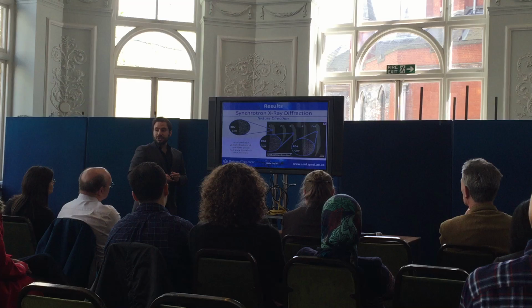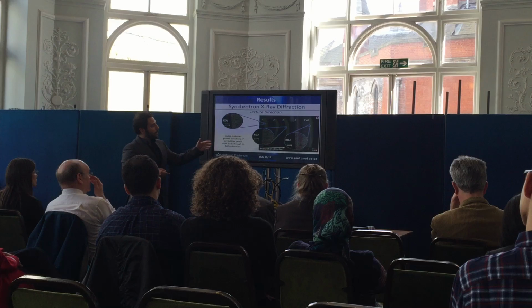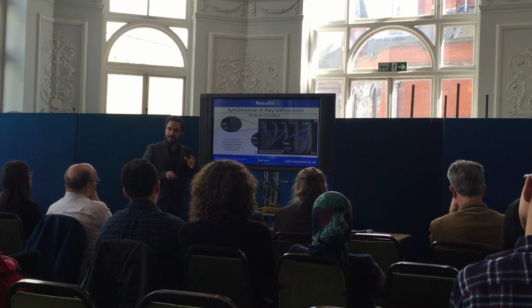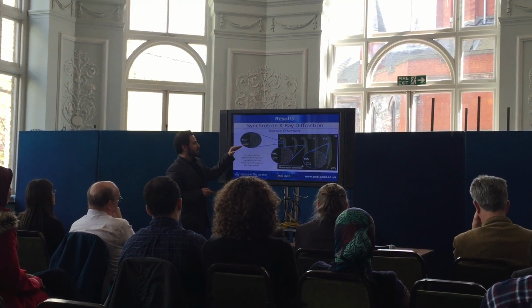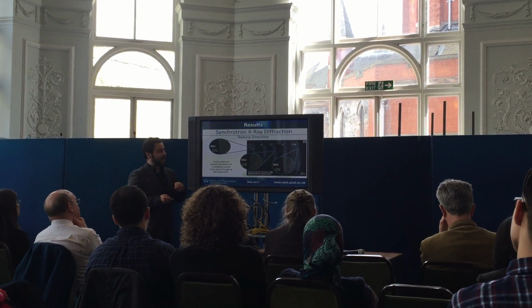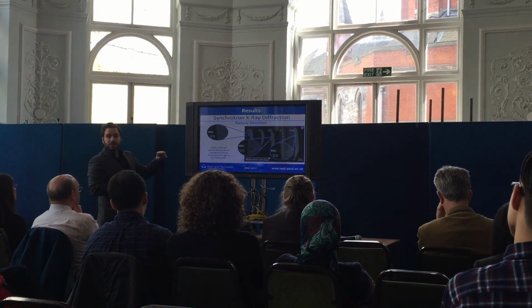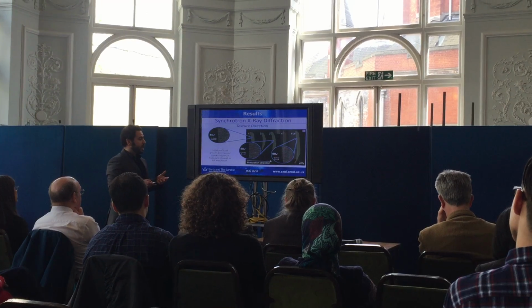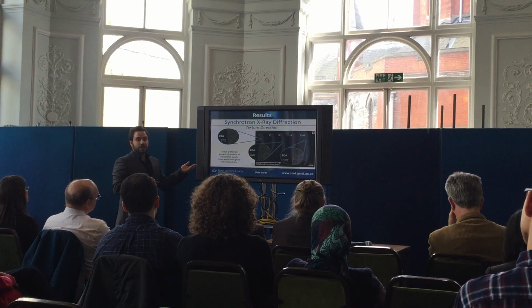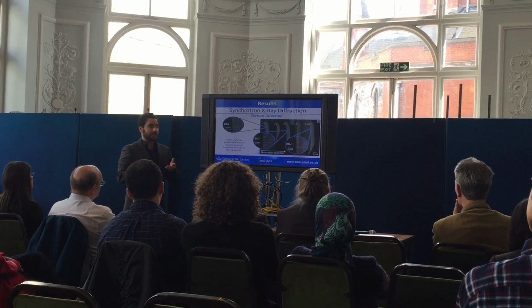The synchrotron X-ray diffraction results, more specifically texture direction. For each tooth, I acquired an average of 5,000 diffraction patterns. And I drew the direction of each of the crystallites within these diffraction patterns. And I found that the crystallite direction is always approximately perpendicular to the EDJ, regardless of the development stages. This means that the initial preferred growth direction persists from early through to full maturation.